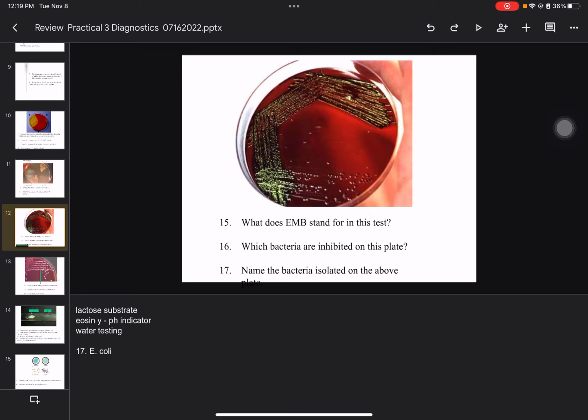This is only good for gram-positive cocci that are catalase negative. If you do it for catalase positive, you're gonna be chasing phantoms. Do not make this hard. It is not hard. You have to think about it logically. That's what critical thought is. That's what this course is about.